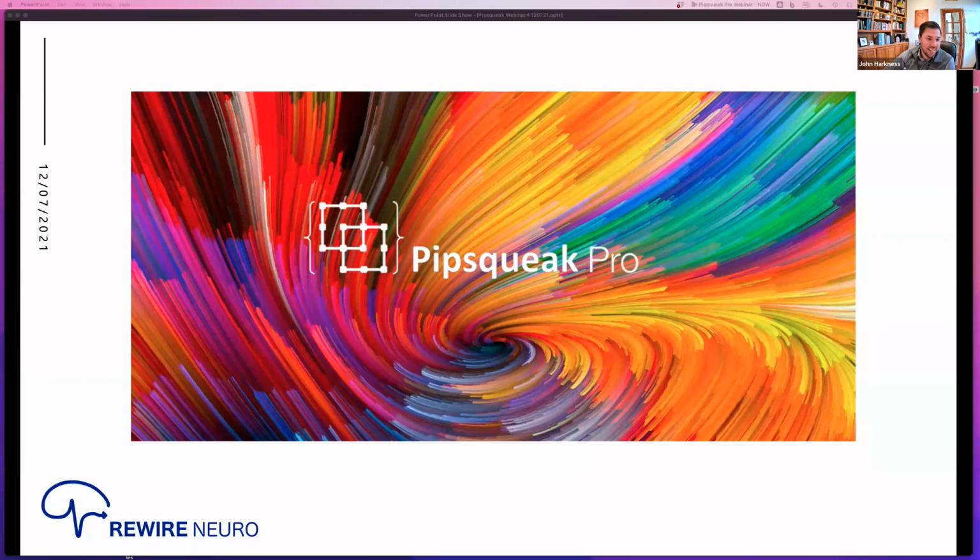That's great. Yeah. I'll talk a little bit about the origins of this, but ImageJ is certainly where I was doing a lot of my cell counting during my postdoctoral fellowship, and so Pipsqueak was one of those great ways that we figured out how to automate this process and speed it up. So nice to see it benefiting others as well. Yes, it's amazing. I guess you use some kind of program when you detect edges of high and lower contrast pixels or something like that.